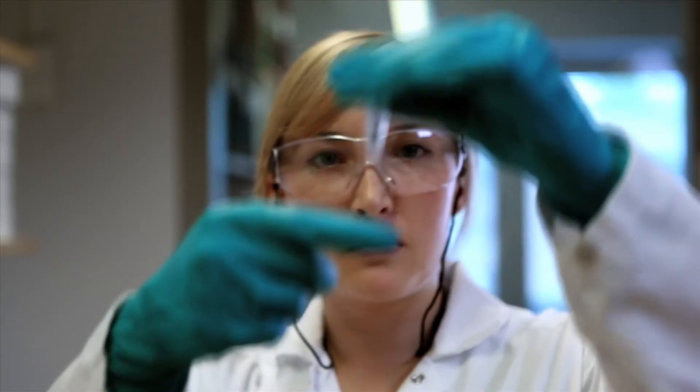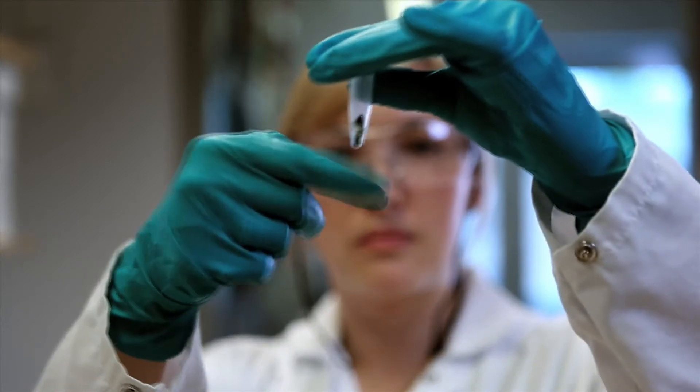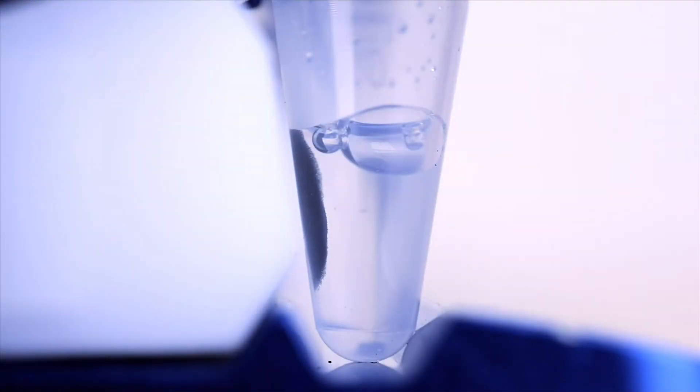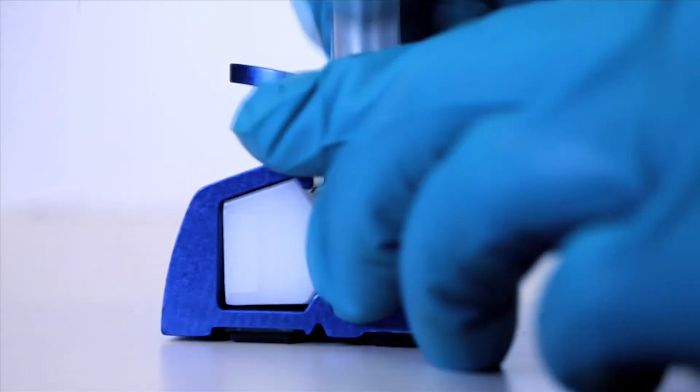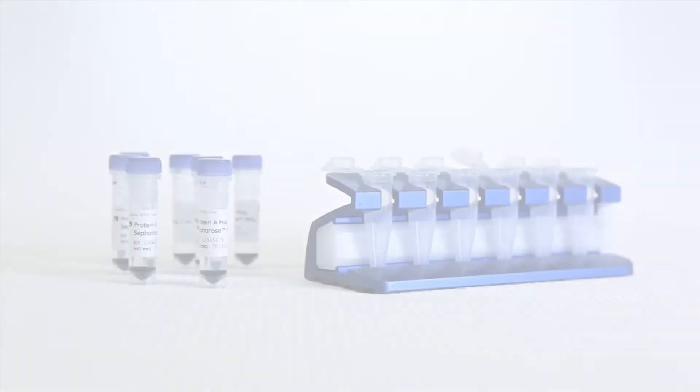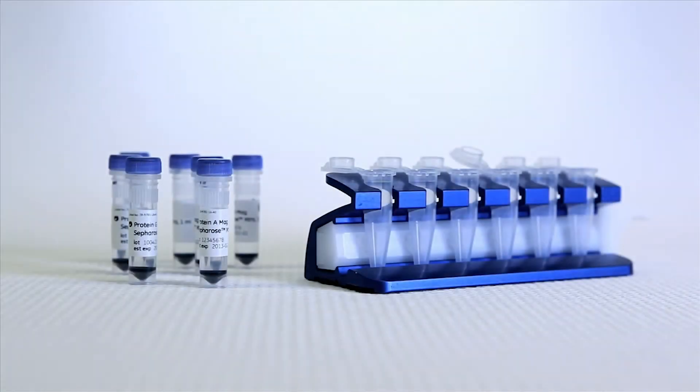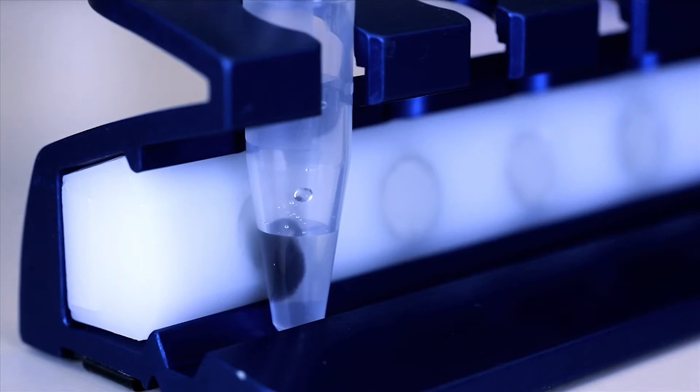The MagSepharose platform combines well-proven enrichment and purification methods with magnetic bead technique and provides high-quality and reproducible results. The beads are scalable and provide simple capture of target protein in small or large sample volumes from low microliter to high milliliter scale.